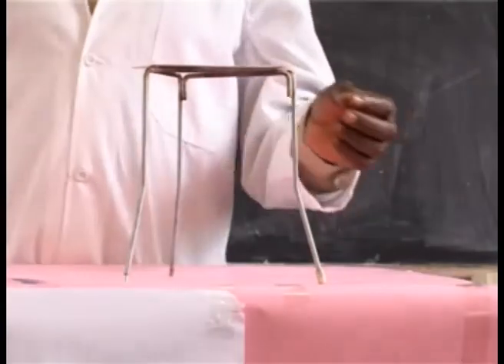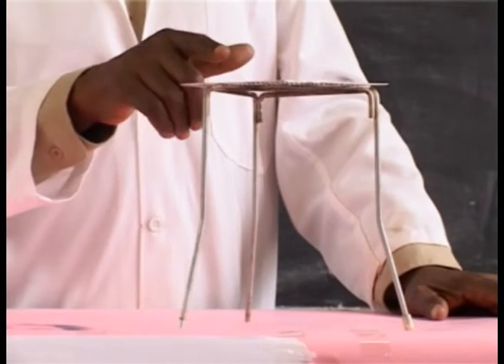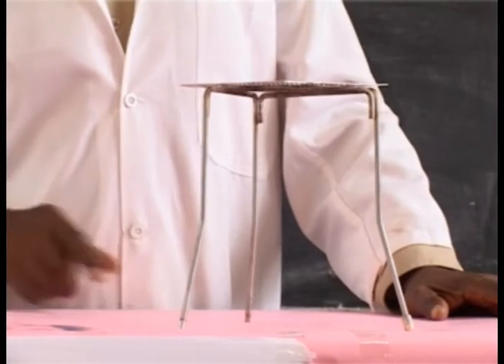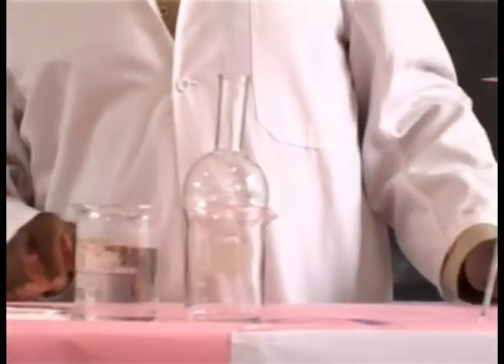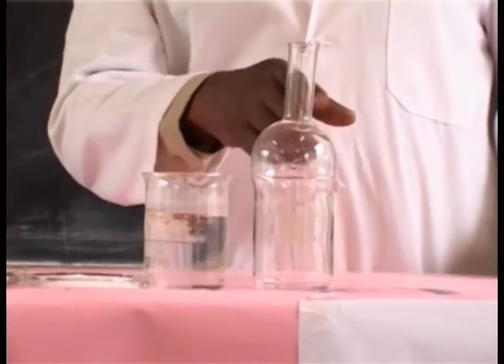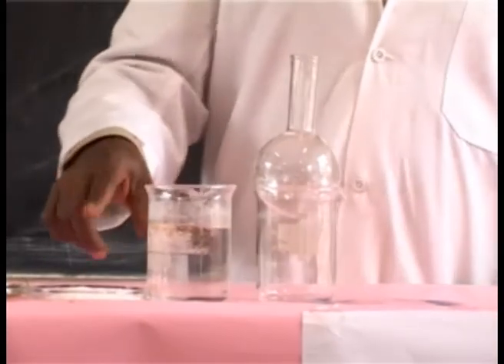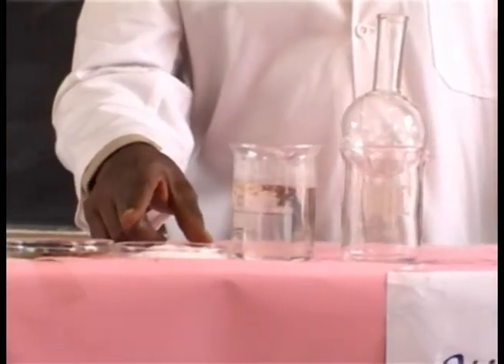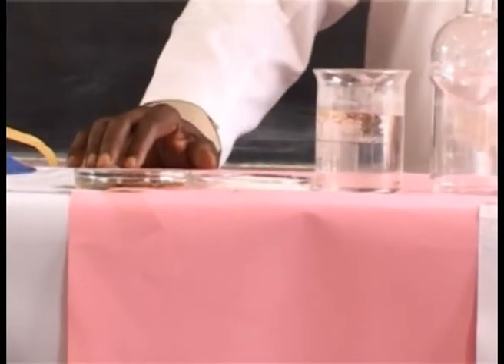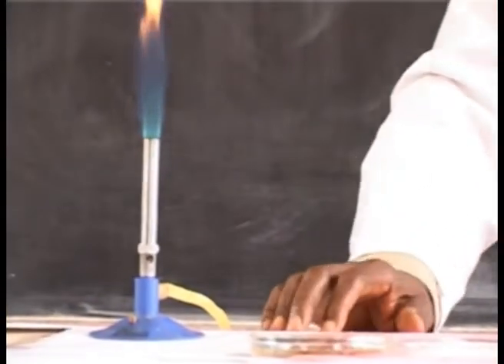You will need the following materials and apparatus: a tripod stand fixed with a wire gauze with asbestos, two beakers and a round-bottomed flask, two petri dishes containing the substances we want to mix, a Bunsen burner and gas source.